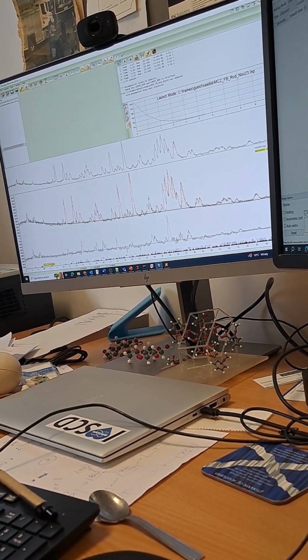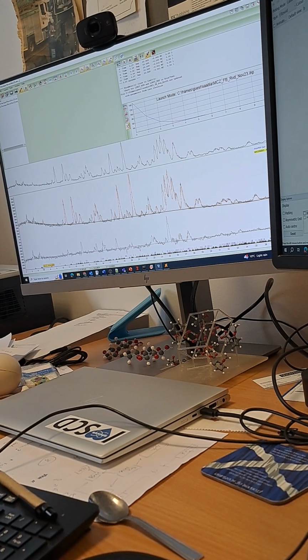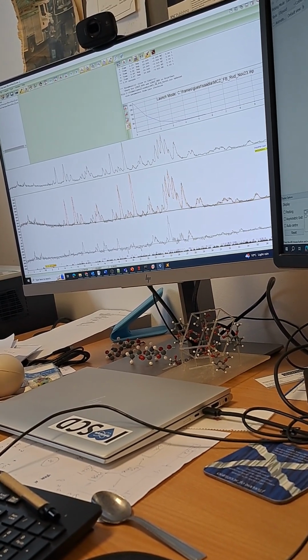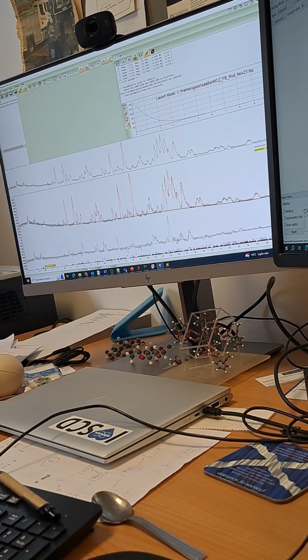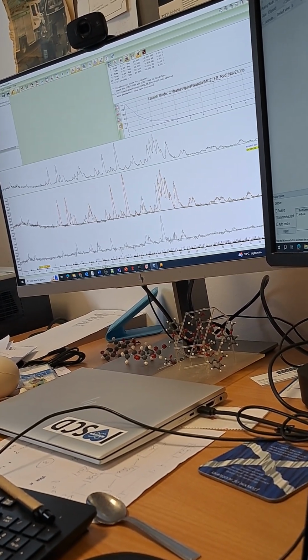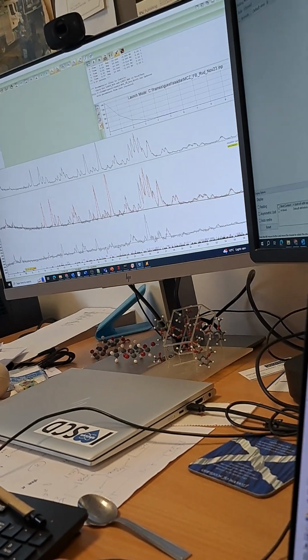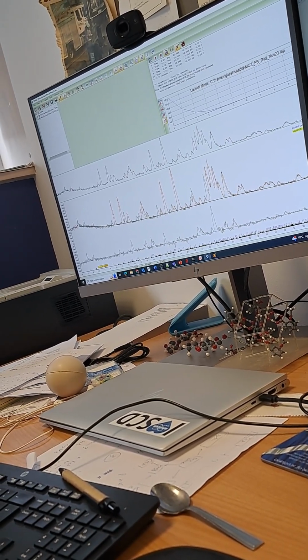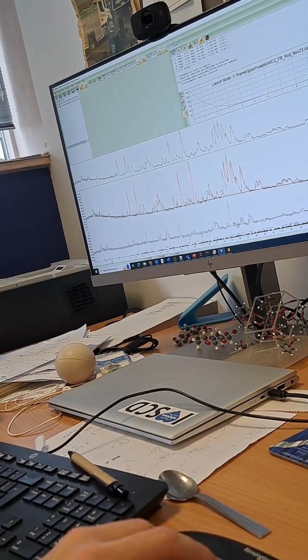So if we want to move that peak, we need to move C, but we can also think about the beta angle as well. Let's just think about the axis length, and beta hopefully will sort itself out, because the sine of the beta angle contributes as well. But let's not do that.